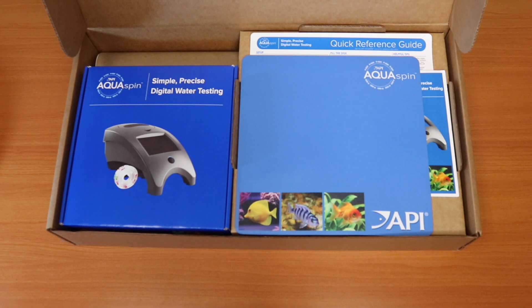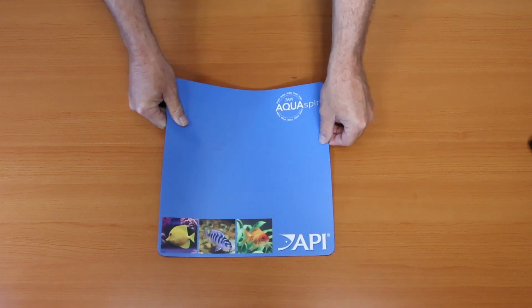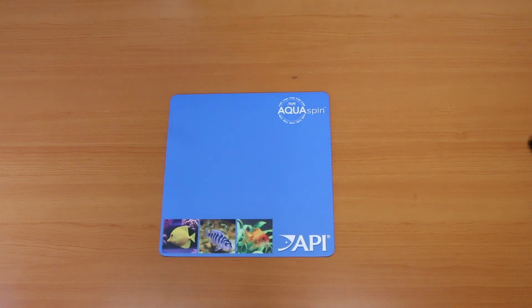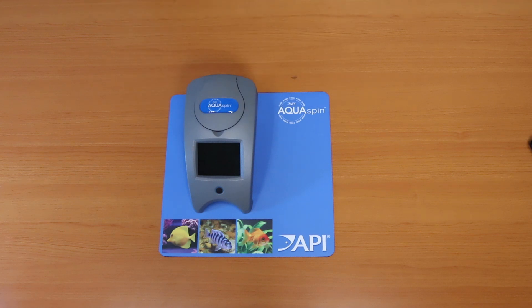Congratulations on selecting the API Aquaspin meter. Let's go through what's in the box. As you open the box, you'll see the API Aquaspin counter mat. The counter mat is ideal to absorb any vibration from the Aquaspin meter itself during testing, as well as locate the meter and identify to your consumers where your testing center is.